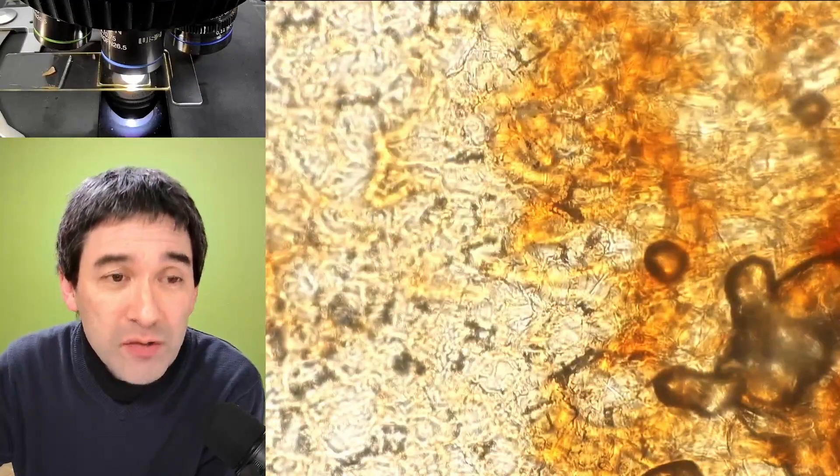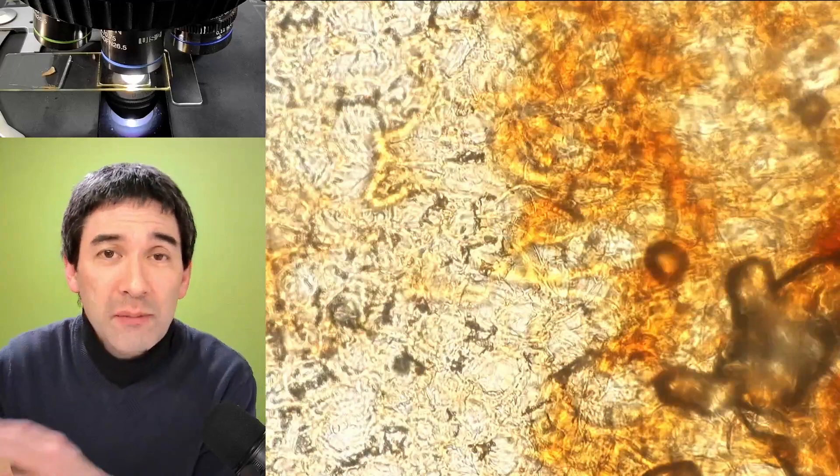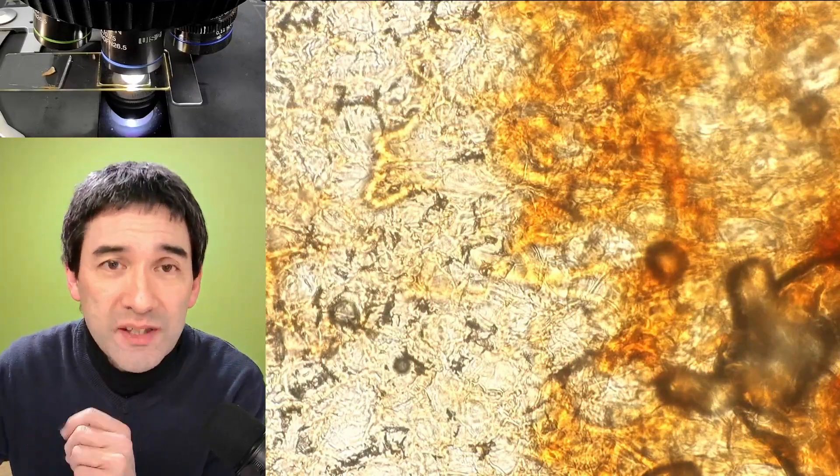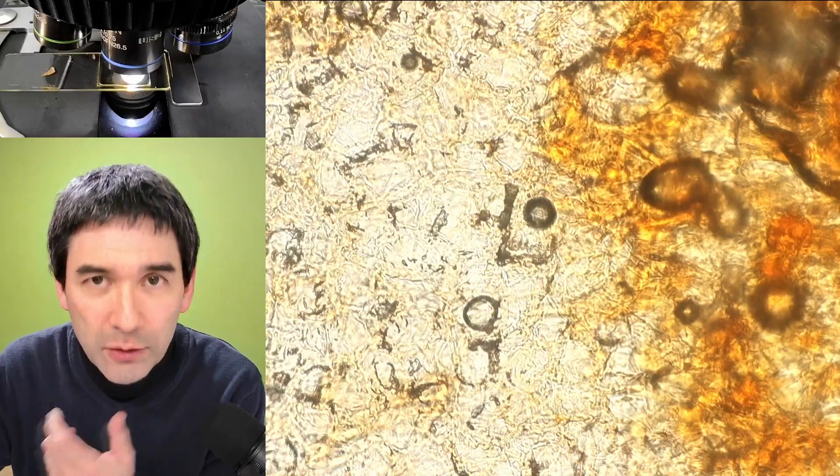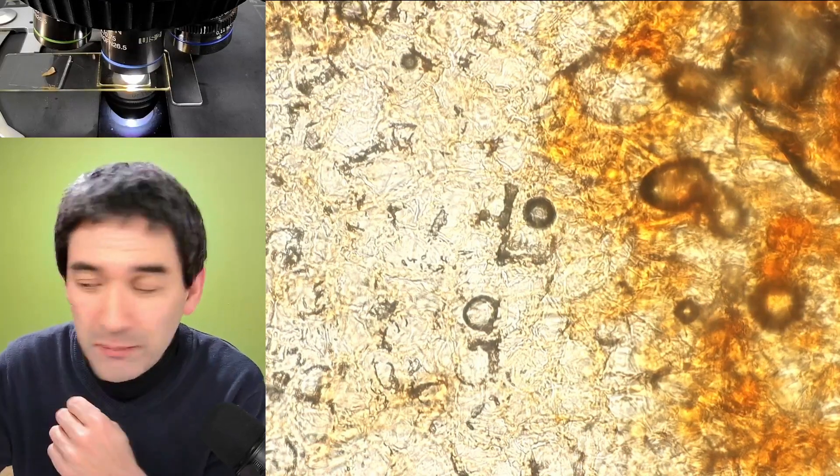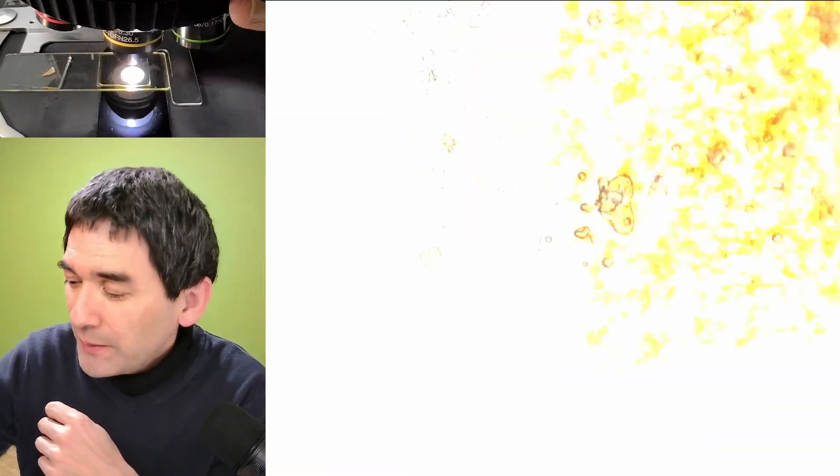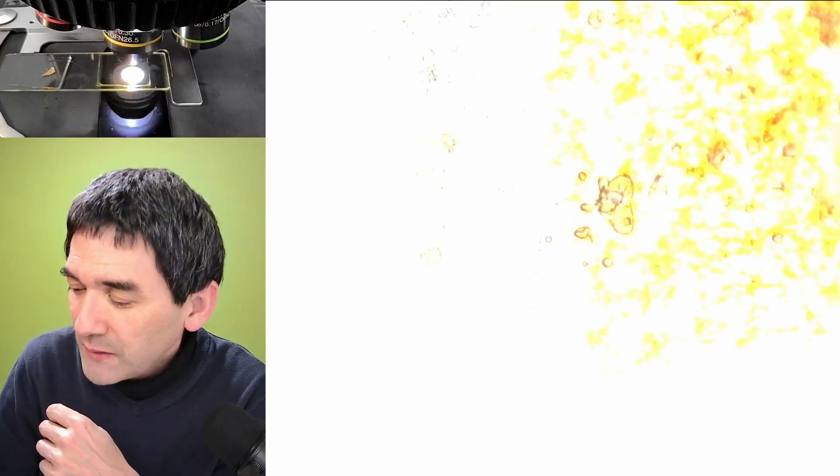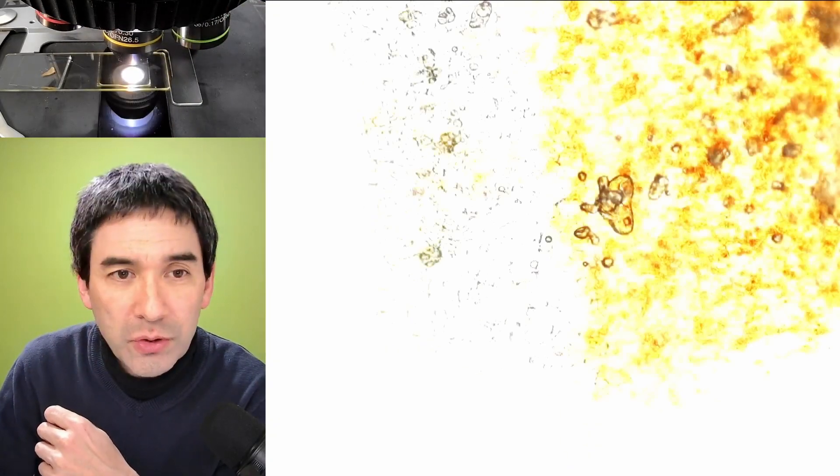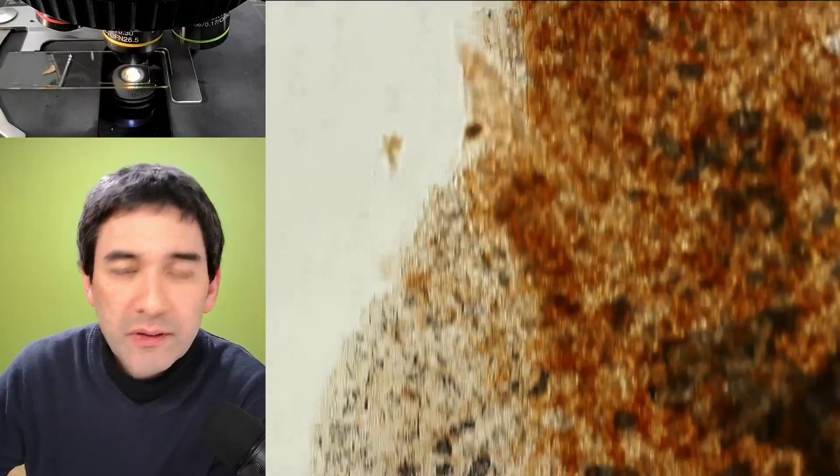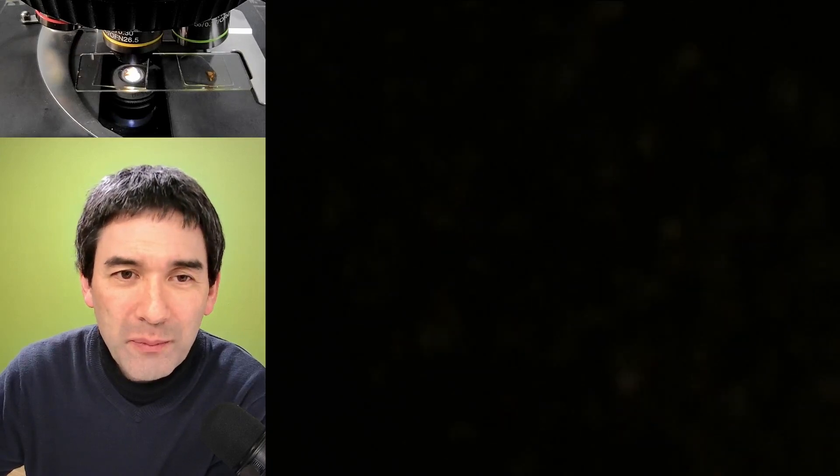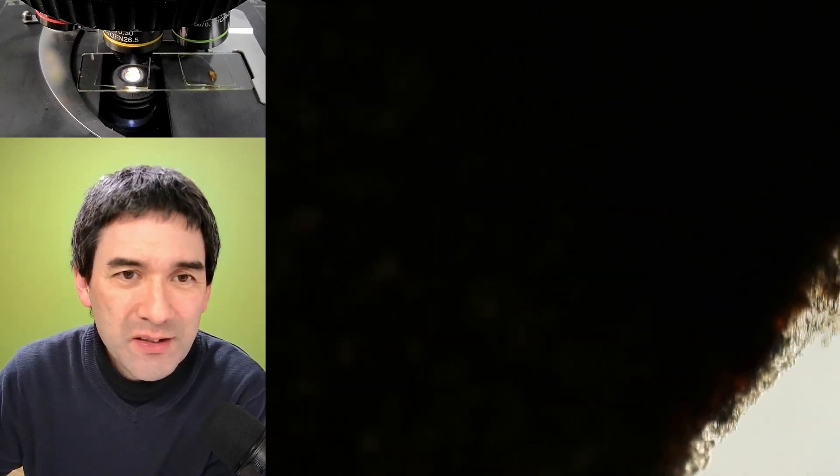Now, again, the reason why I've chosen this specimen is not because it looks kind of nice or anything interesting. That's not the point. I really wanted simply to show you the effect of different mounting media on the specimen and why this matters. Let's go down with the magnification again here. Let's have again, I have to turn down the brightness as well. That's a 10 times objective. And then again, over here, that's the one with the PVA glue, the water-based glue, and it's totally dark.